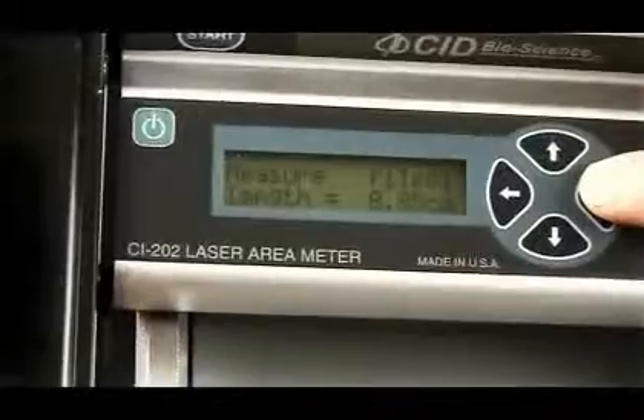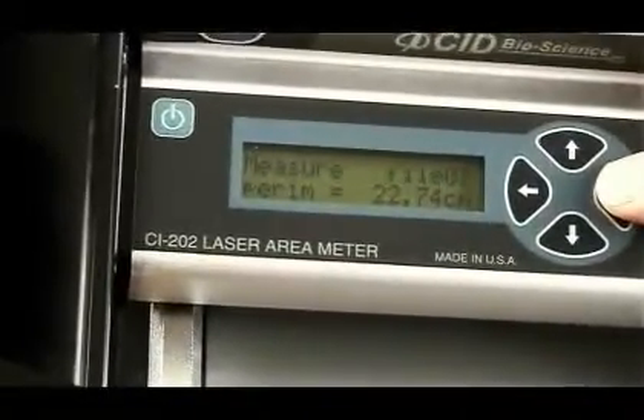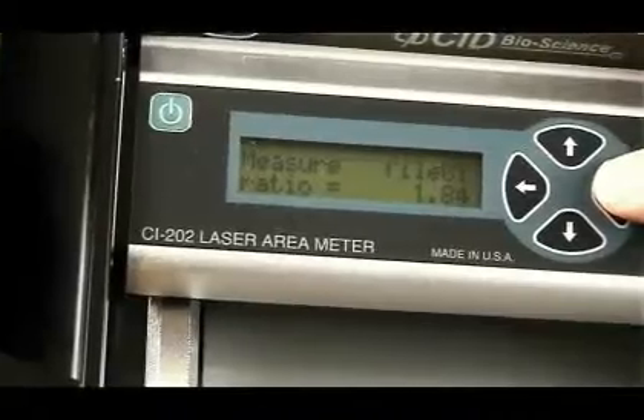The CI-202 measures area, length, width and perimeter, and calculates shape factor and aspect ratio.